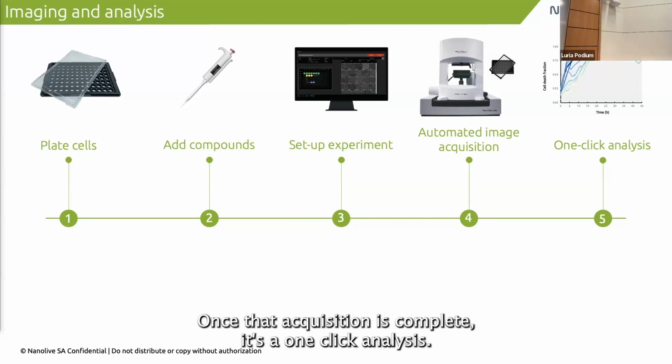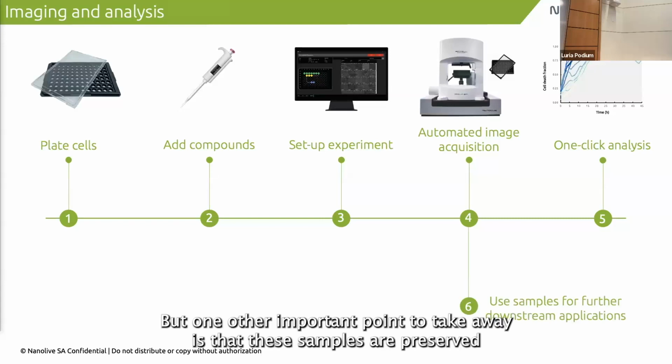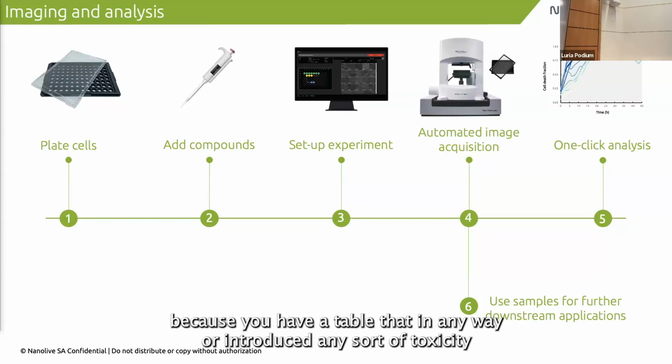Once that acquisition is complete, it's a one-click analysis, and I'm going to touch very briefly on what our analysis looks like. But one other important point to take away is that these samples are preserved because you haven't labeled them in any way or introduced any phototoxicity.